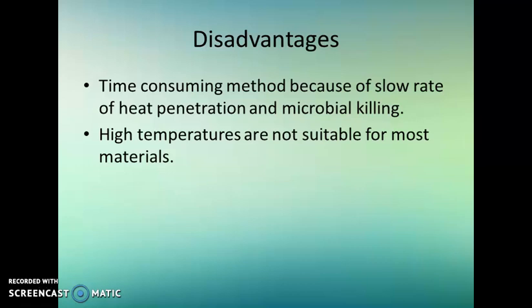So it is more time consuming, also because of the slow rate of heat penetration and microbial killing. Heat penetration is very slow compared to the moist heat method, in which heat penetration is very high, and microbial killing is also high, that is using an autoclave.